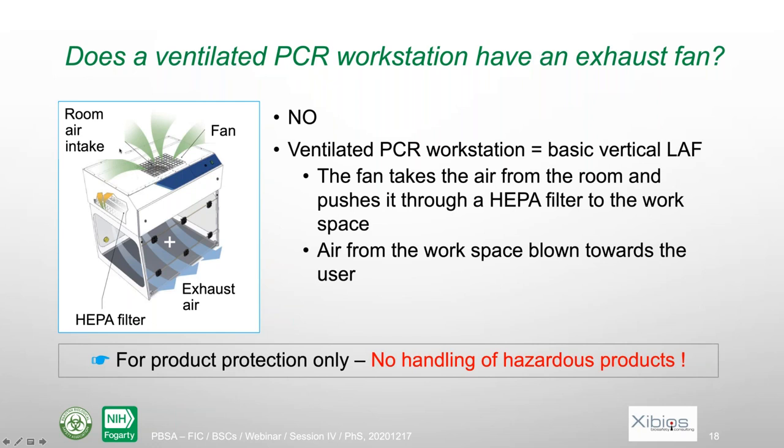There is a fan inside, but that fan pulls the air from the lab on the top. Then the air is pushed through a HEPA filter and then pushed down on the working space, which is thus in positive pressure. So it's very close to a vertical laminar airflow bench. That means that the air which is pushed down there can be contaminated and will be exhausted in the lab. That means that it's definitely for product protection only, and there should also be no handling of hazardous products.